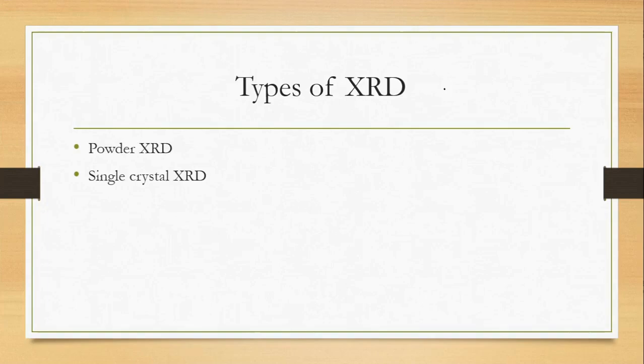So now that we have understood how X-rays are formed and what types of X-rays there are, if you want to know what types of detectors are used, normally you would see something like a CCD or a scintillator or a phosphorescent screen.